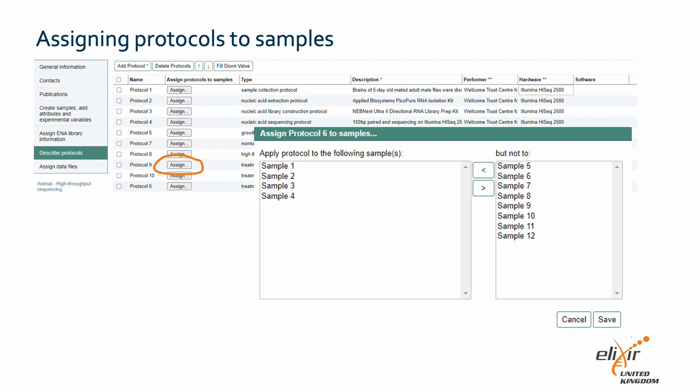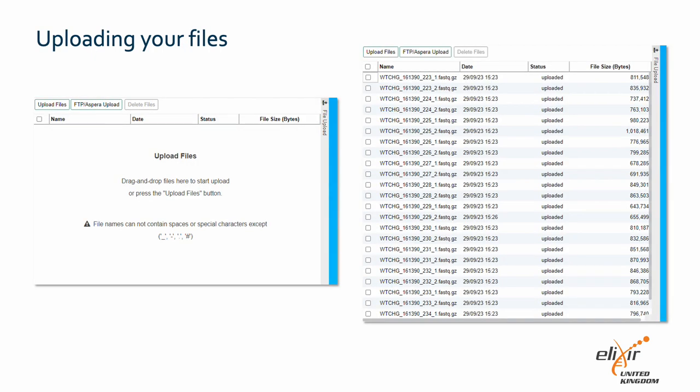By clicking the 'Assign' button, you can indicate which protocol belongs to which sample. Now we have provided all the metadata relating to our samples. It is now time to upload our files. You can just drag them to the right-hand side of the submission form and they will be automatically uploaded. Upload your read files and all the processed data files that relate to these samples. For large files, you may be asked to transfer data files via the FTP command line. Instructions on how to do this are given within the tools interface.